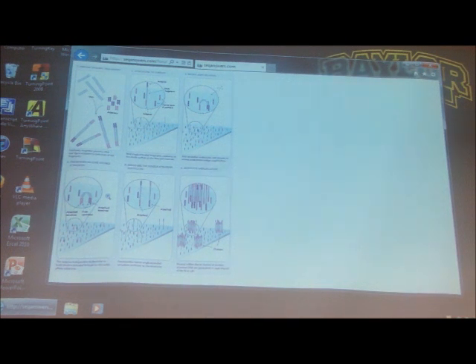And once we've amplified all those oligonucleotides, we have these batches of oligonucleotides. They're not in cells. They are in little groups on the plate. And we have a video for that.